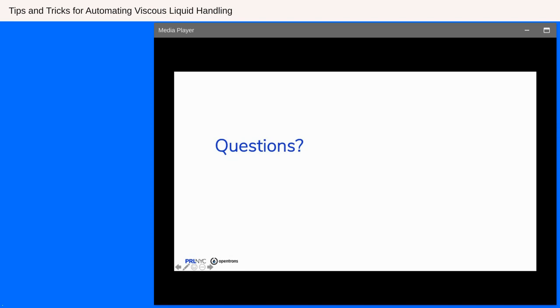Yeah, that's a very good question. Mixing viscous liquids is a little tricky affair. It really depends on what kind of labware you're using. First of all, if you're going to use very tall labware, for instance a 15 ml tube or a 50 ml tube, and depending on the volume inside your labware, it's difficult to mix if the volume inside your 15 ml Falcon tube is at the maximum.